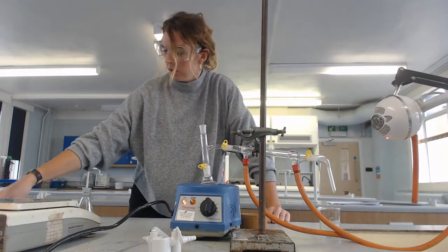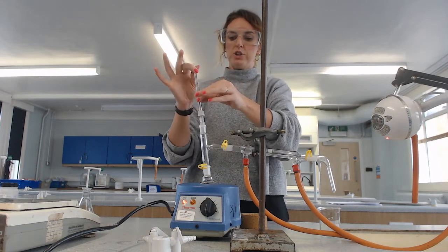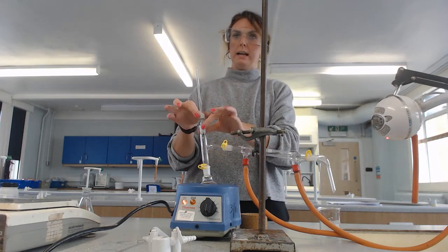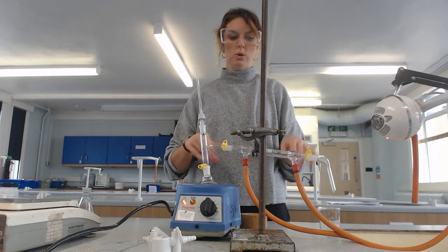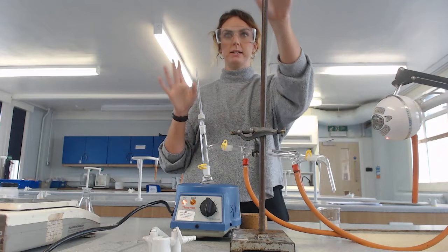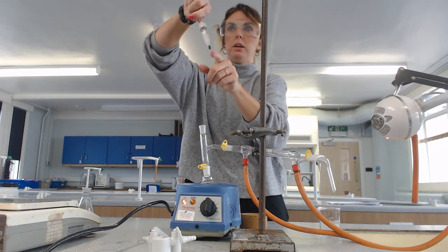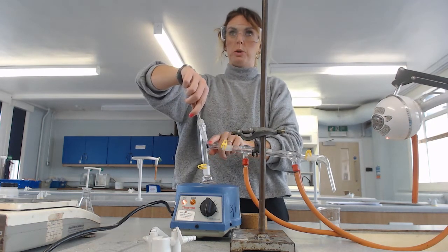Before I turn on the heating mantle, the final thing is to put our thermometer in. As shown, that position is wrong — a common exam question on this required practical is to draw this apparatus. A common source of error is the bulb of the thermometer: the bulb needs to be in line with what's called the side arm.